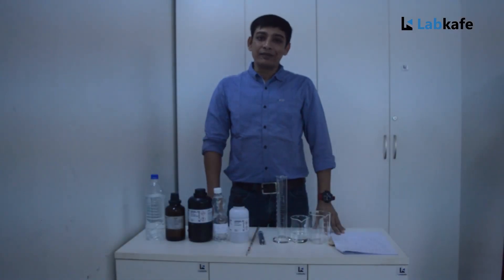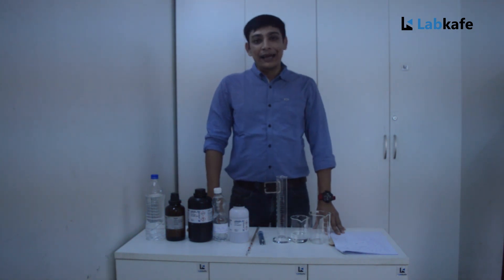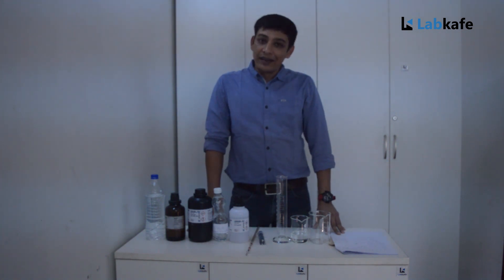Hello and welcome to the LabCafe's practical session. Today we are going to learn how to prepare hand sanitizer at home or in our lab at a very reasonable price. The formula we are using to prepare the sanitizer is as per WHO guidelines. So let's prepare 500 ml of sanitizer.